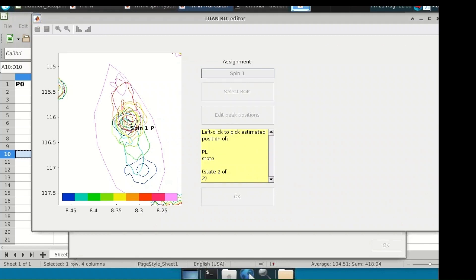When a region of interest has been selected for the final spectrum, you will be prompted to provide initial estimates of peak positions for each state in the binding model by left-clicking in the left-hand panel. The links in the top panel can be used to return to the ROI editor and to include or exclude the spin from any fitting process.